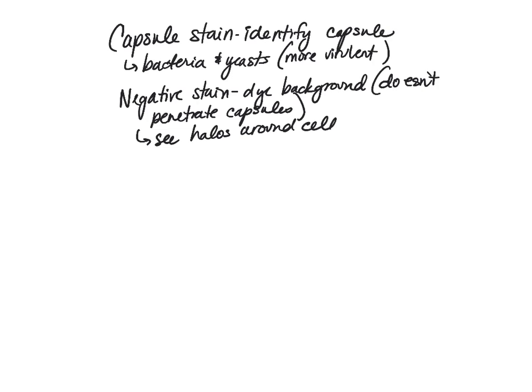oftentimes if we do a simple stain, we'll just use nigrosin, or we can use India ink, which gives us a nice dark black background.